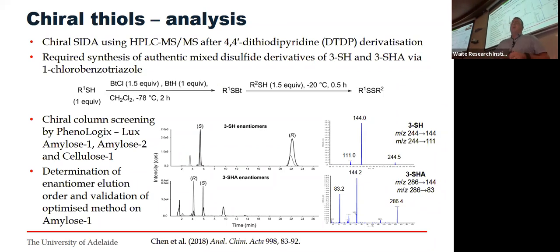We took that liquid chromatography method with the derivatization that we had worked on and converted that into a chiral method. That involves screening different columns. You don't just go out and buy a chiral LC column every day of the week. They're like $2,500. So we had to make this authentic derivative, which we don't normally do. We just take a sample, that 20 mLs, and spike things and then analyze that.